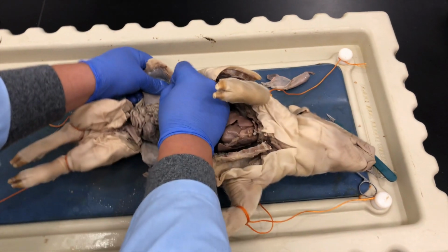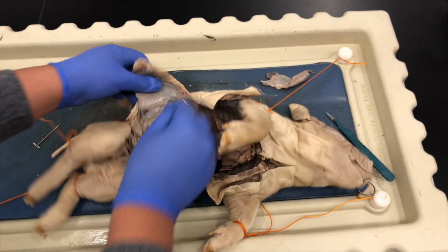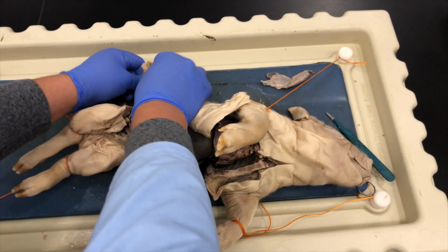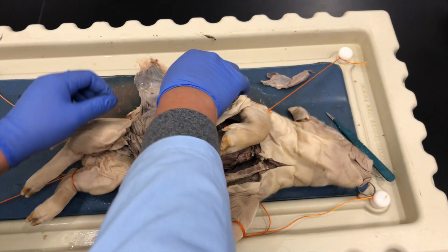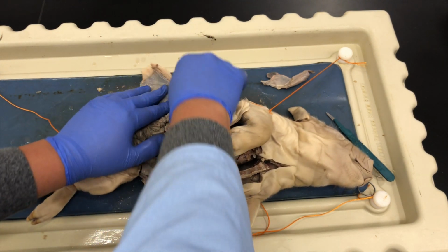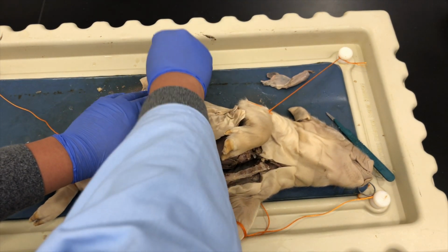Here I am using the pins to hold down parts of the flaps that I've already cut out, just so you can observe it a little clearer. It helps so it doesn't get in the way as well because it does tend to want to close.